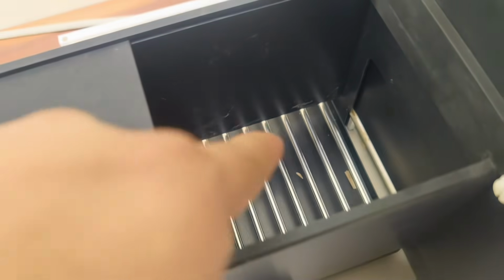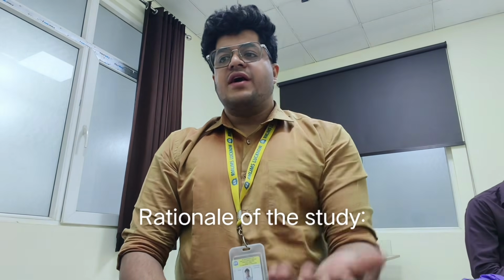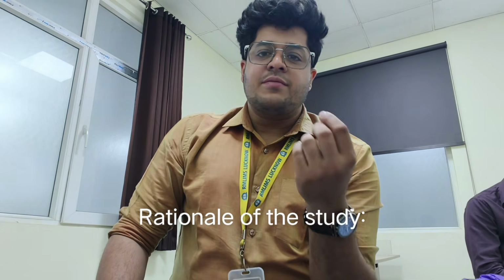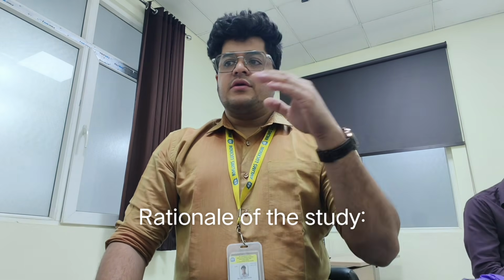This is the dark environment. Whenever we are working with rodents, they have a natural tendency to move towards the darker environment. Now while they are approaching the darker environment and we give an unpleasant stimulus such as a mild electric foot shock, it creates an association that the dark environment and unpleasant stimulus together should be avoided. So that is how we can study memory. Both long term as well as short term memory can be studied using this model.